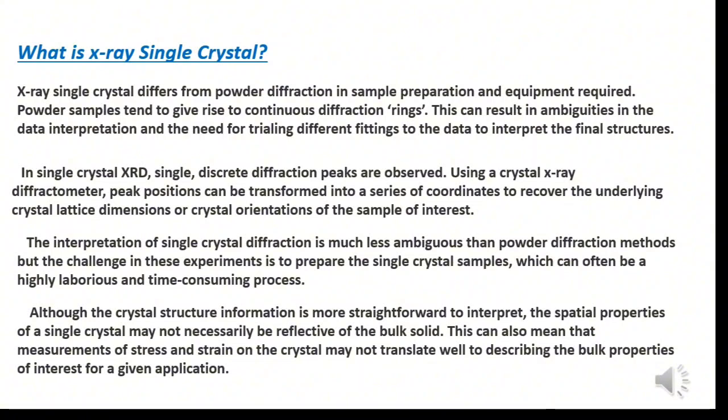Although the crystal structure information is more straightforward to interpret, the spatial properties of a single crystal may not necessarily be reflective of the bulk solid. This can also mean that measurements of stress and strain on the crystal may not translate well to describing the bulk properties of interest for a given application.